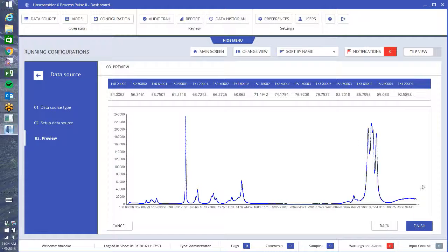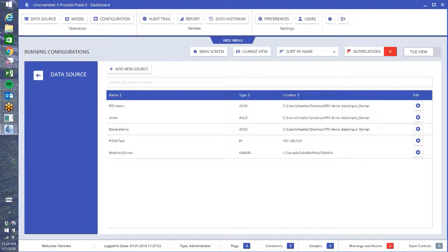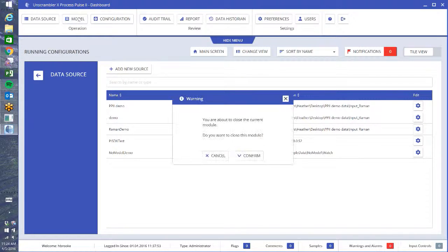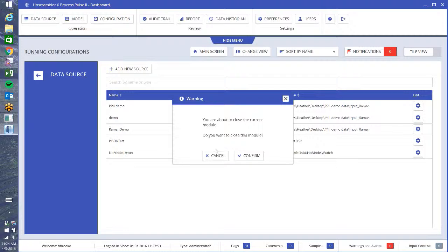So I can go ahead and say finish, and now I have a new data source. The second step is going to be importing your models. This is a nuisance alarm just to remind you that you're moving away from your data source module.